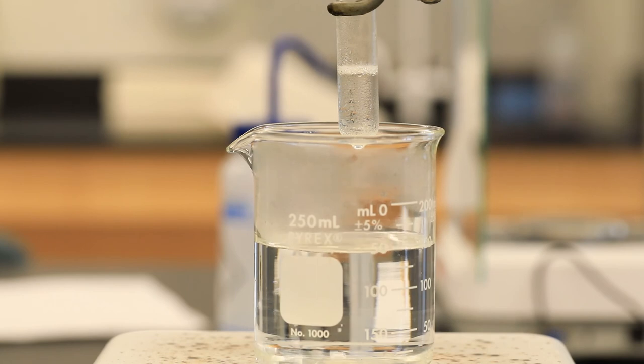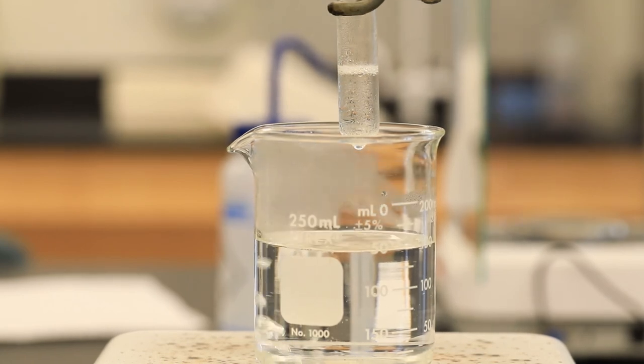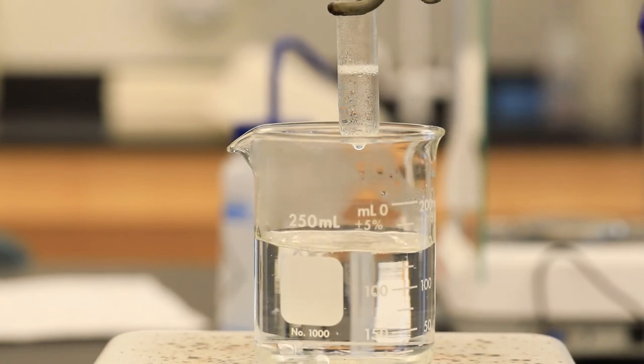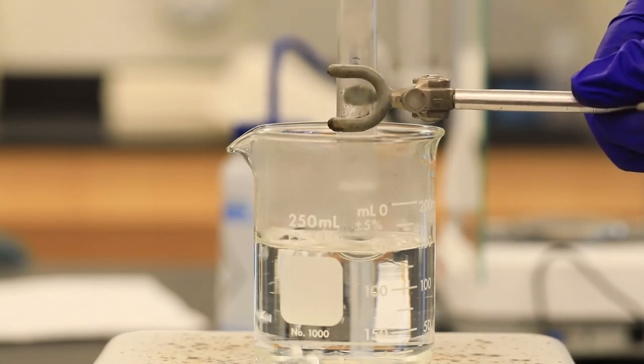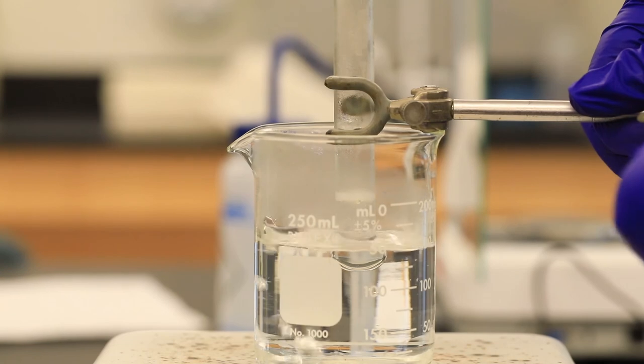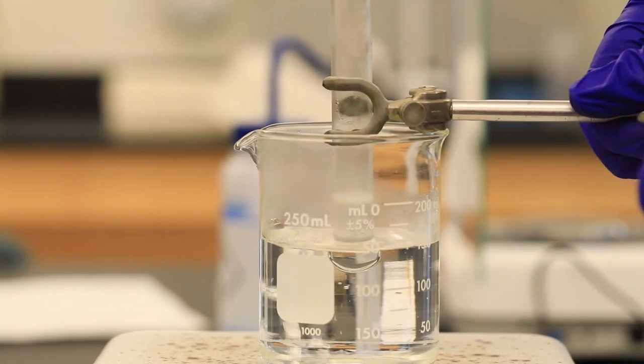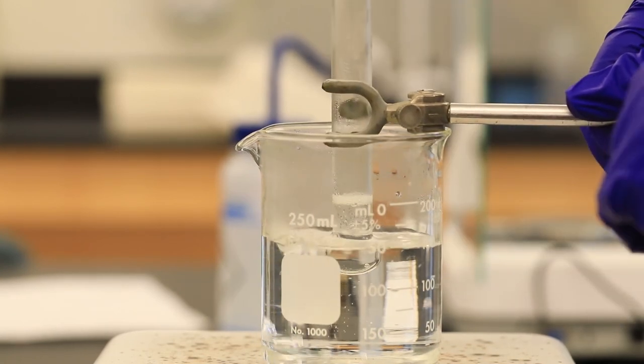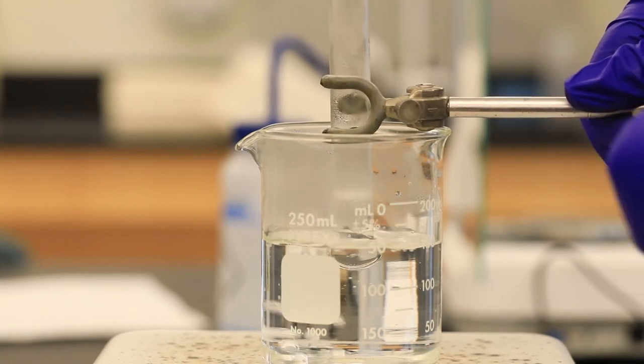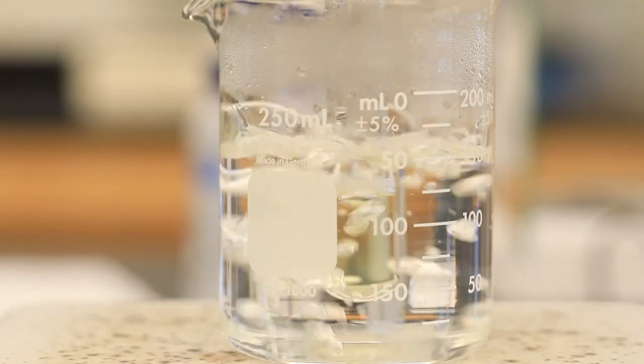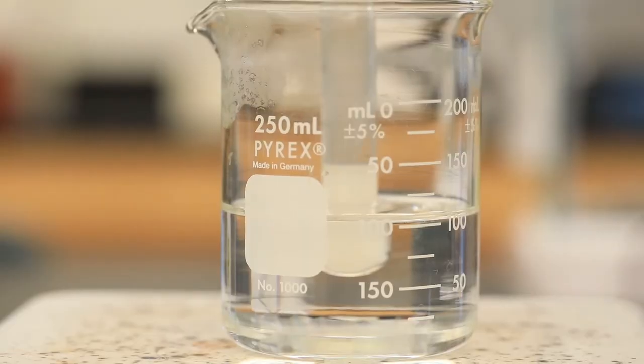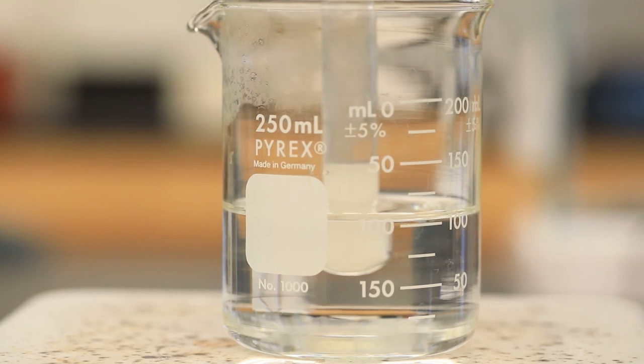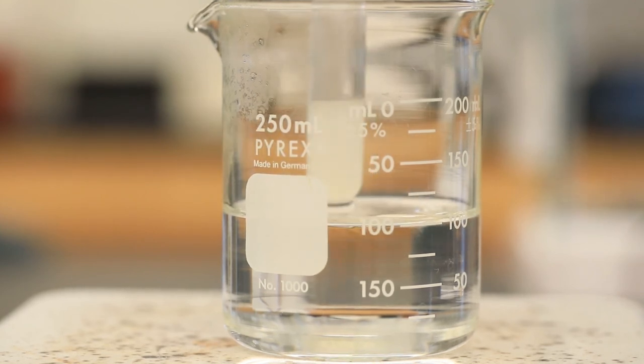In this part of the experiment, we're going to do the test for heat coagulation. Here we have our solution of casein. I'm going to immerse that in a hot water bath for approximately three minutes, and then we'll come back to see the results. After three minutes of heating, I need you to record exactly what you have observed.